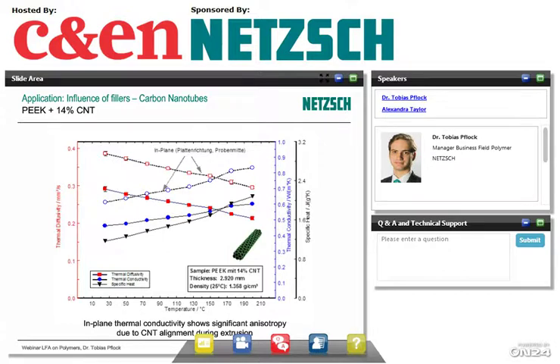And we see this is quite anisotropic, and obviously we have more heat transport in plane than perpendicular to the plane, and that can easily be seen with the LFA technique. This is actually one of the specialties of the laser flash technique, because laser flash is the only technique that can measure the anisotropy in thermal transport.